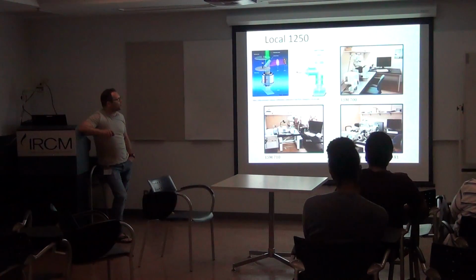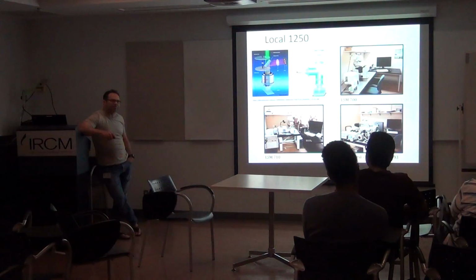It's another laser scanning microscope, which is another brand. Those ones are Zeiss microscopes. The other one is a Leica microscope. Basically the same principle.